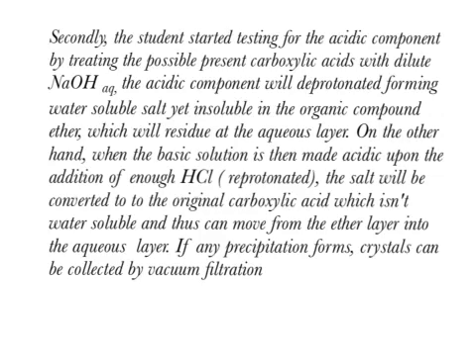On the other hand, when the basic solution is made acidic upon the addition of enough HCl, the salt will be reprotonated and converted to the original carboxylic acid, which isn't water soluble. If any precipitate forms, crystals can be collected by vacuum filtration.